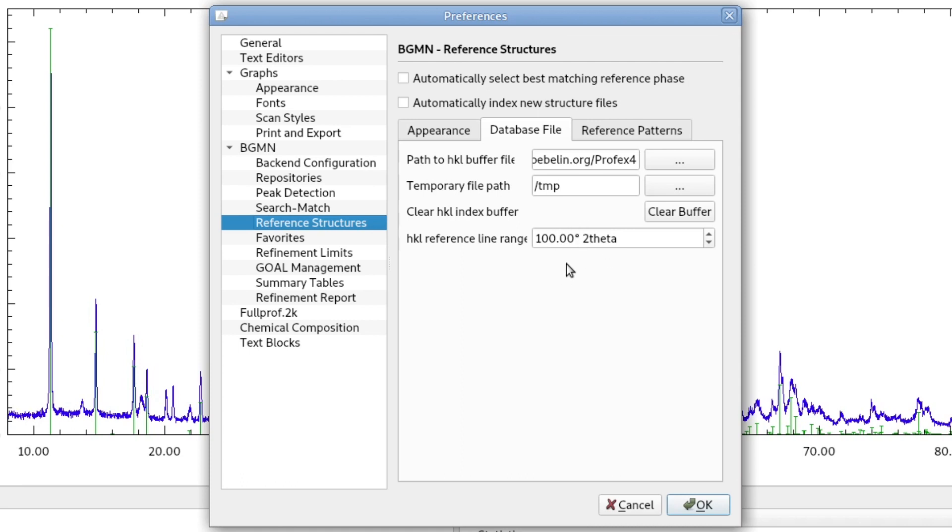If you are using a longer wavelength like cobalt or chromium, you will get HKL lines a little bit higher than the value you set here. In the coming version of Profex, there will be a new button here so you can specifically select your wavelength and it will go exactly to the 2 theta value for the wavelength you select.